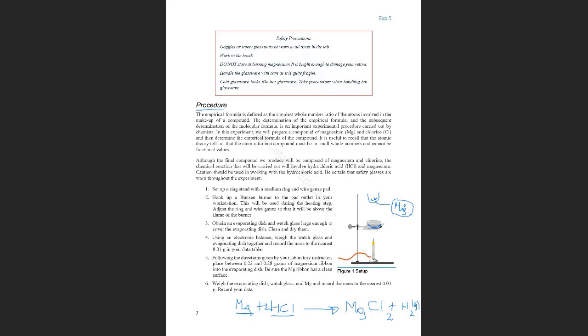Now, what is the objective of today's experiment? Let's say that we don't know that this is a 2. We have an X and we have a Y. The empirical formula will be the calculation of this X and this Y. We know now that X is 1 and Y is 2. You saw this reaction in the previous experiment.